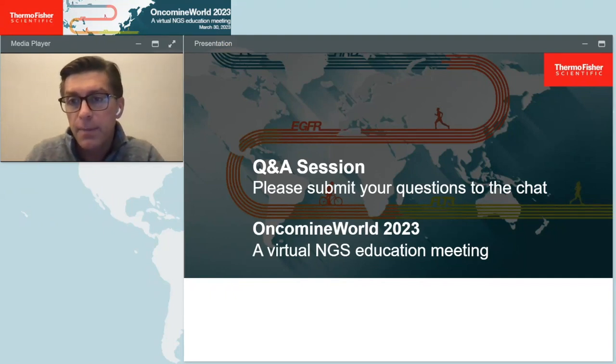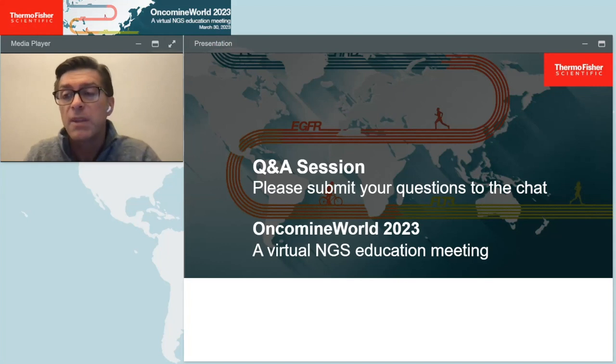All right, can I run libraries that I have already made for other Ion Torrent instruments on the Genexus? So yes, the Genexus does support running library-to-answer runs. You don't always have to create library from nucleic acid at the start. And so that means you can use libraries that are compatible with other Ion Torrent sequencers or the Ion Code barcodes.